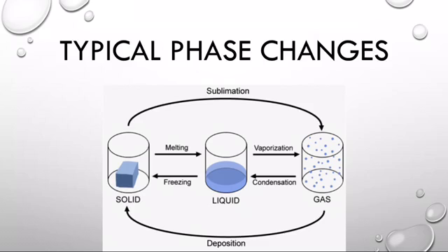Hello and welcome to this week's general chemistry lab. In today's lab, we will be making instant ice out of water, of course. The goal is to catch the water so that it is cold enough to freeze, however, not completely frozen.